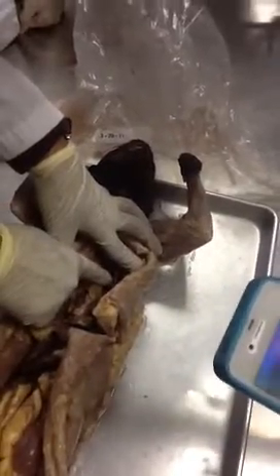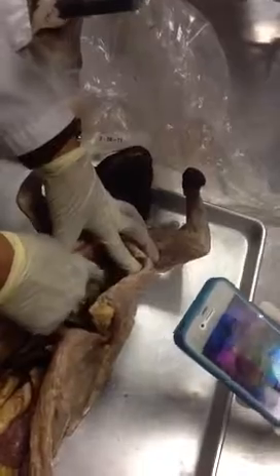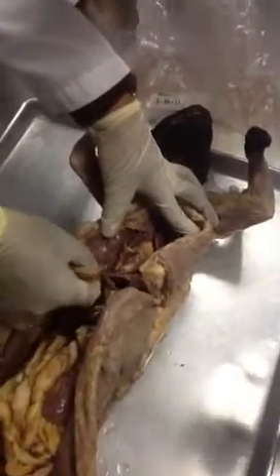The lungs are also covered by something called pleura. There are two layers of pleura. One is the parietal pleura right here in the wall of the thorax, and the visceral pleura is right here around the lungs. You cannot strip it off. Both the lungs and the heart are resting on something called the diaphragm.